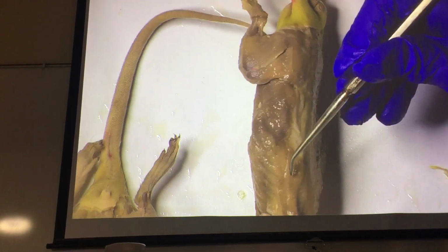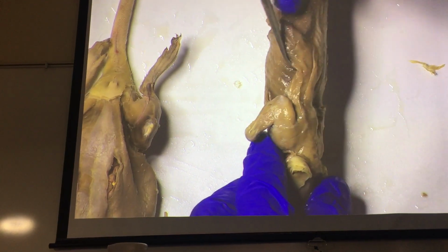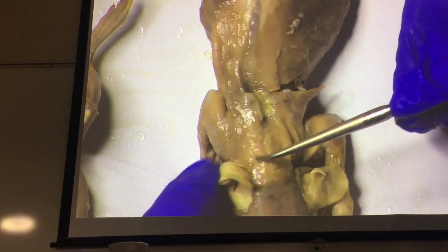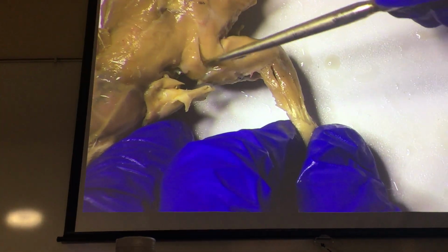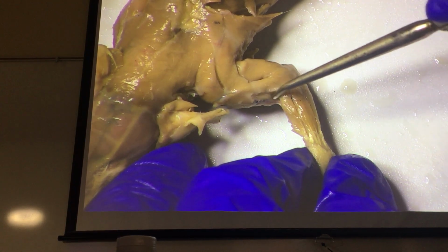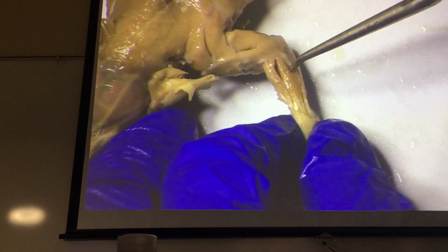Sternal abdominal oblique. Here's our spinotrapezius, and of course it sits on top of latissimus dorsi, right? Spinotrapezius, acromiotrapezius coming up, temporalis, and then looking at the little rat arm, we've got our acromiodeltoid again, spinodeltoid, triceps brachii, brachialis, and then here we have our forearm muscles.